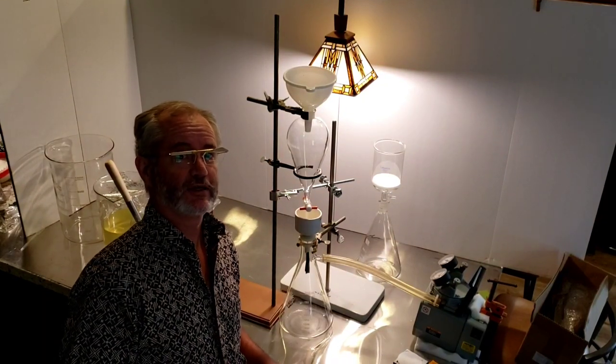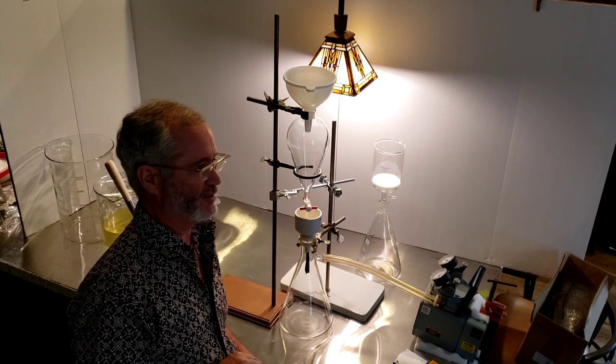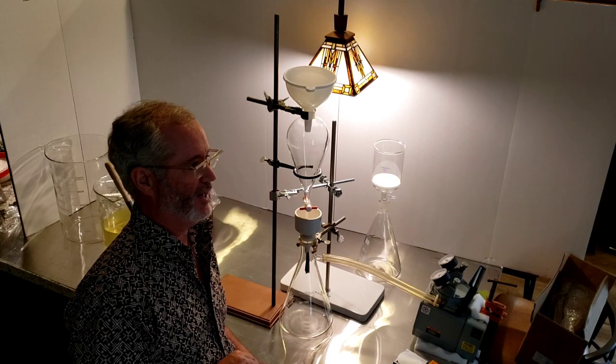Hi, I'm going to filter this — we'll see what happens. That's my first time. I have my chemistry intern apprentice here; he's going to supervise.